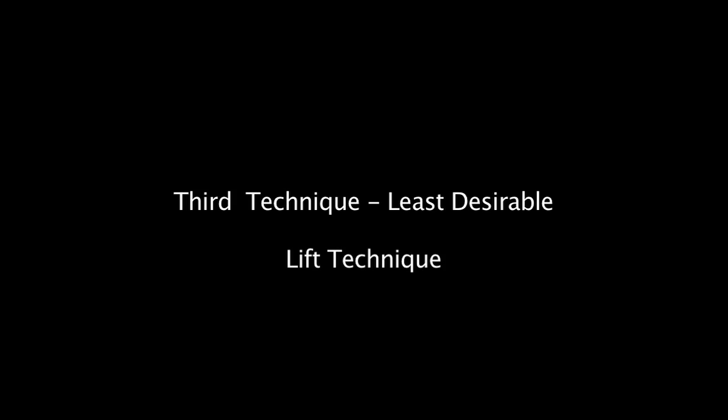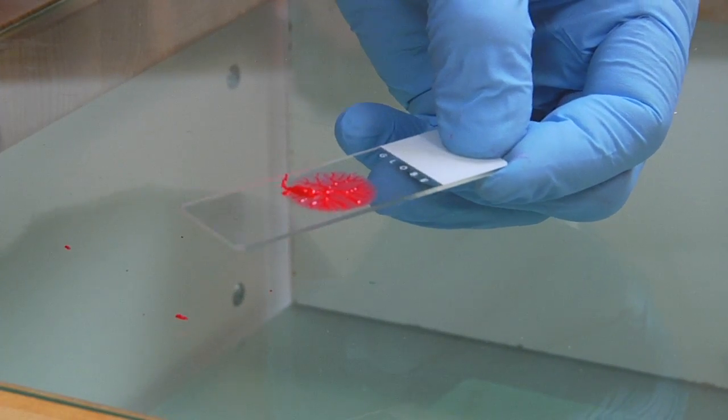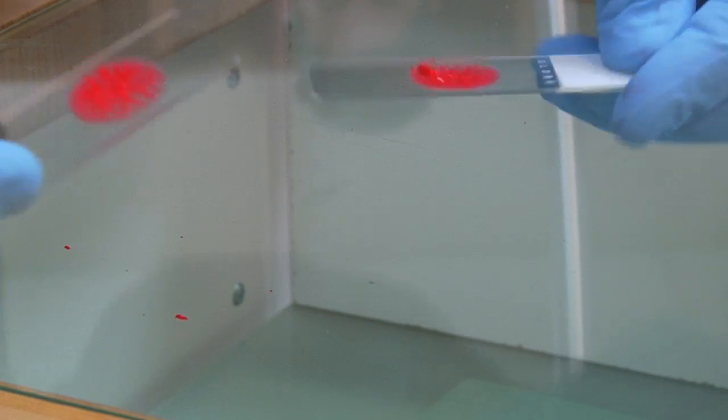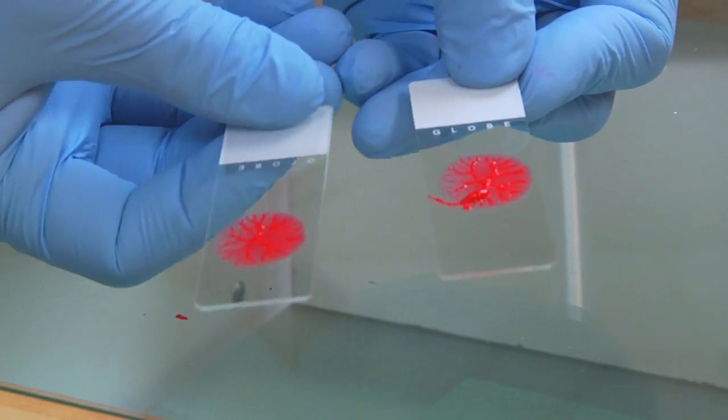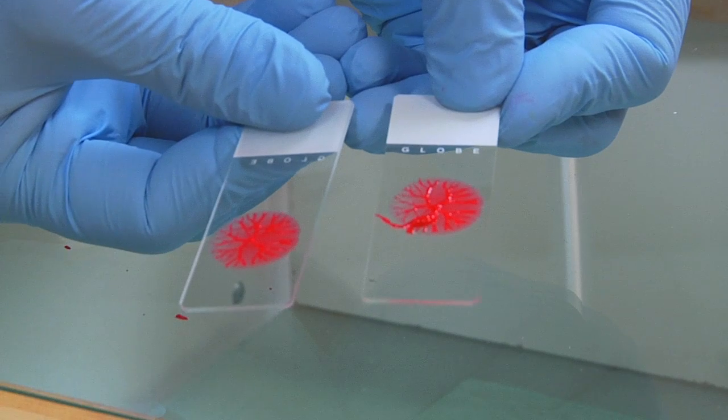In this, the material is gently touched with the spreader and the two slides are pulled apart to make two smears as you can see. This is the least desirable of the three techniques demonstrated in this video.